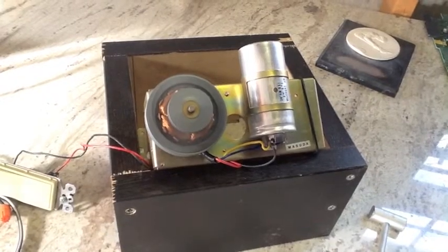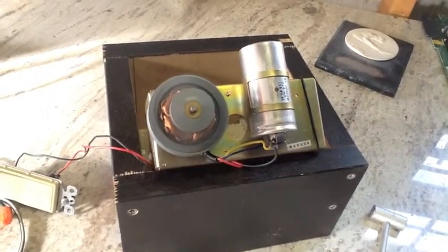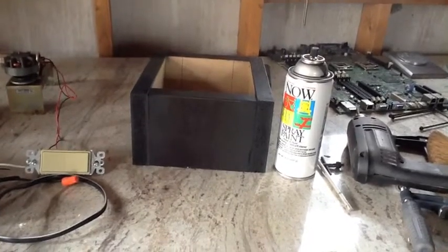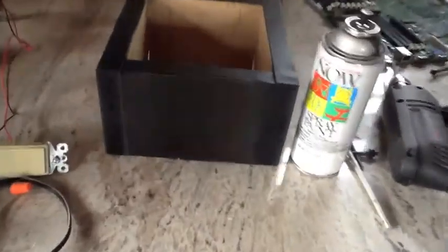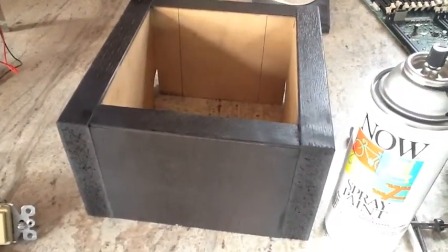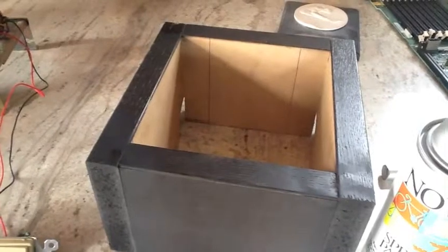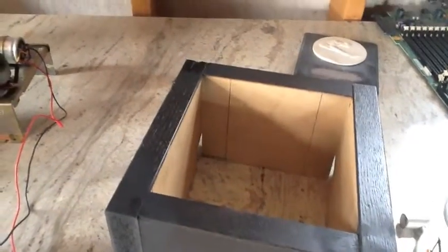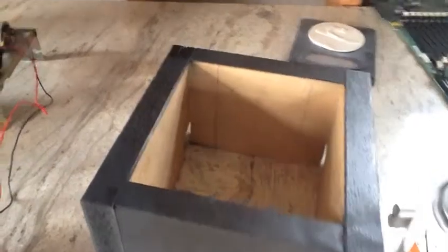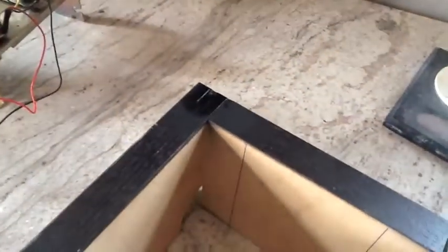A few shots of paint and our color problem is taken care of. I went ahead and hit the top where the circular saw had chipped out some of the factory finish on this MDF or particle board, whatever they call it nowadays. So it'll work.